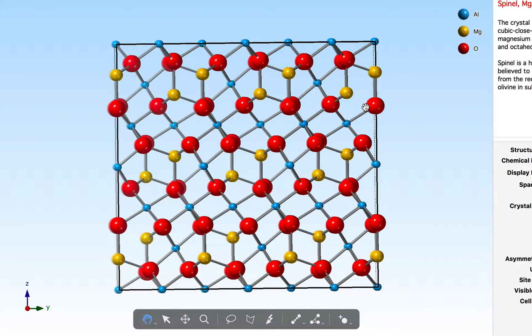There we are. Now we also need to add some vertical space to fit our molecule into this structure and I'm going to use the lattice plane parallel to 001 which I'm going to reposition and use that to indicate where we want some more space.